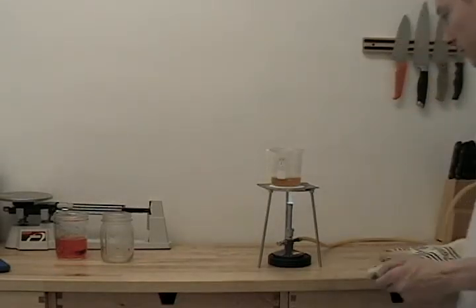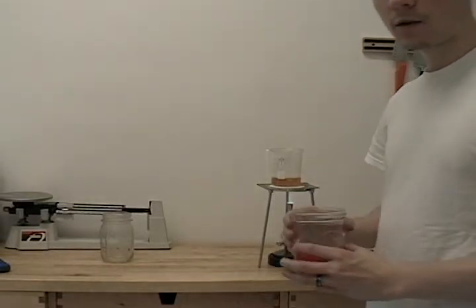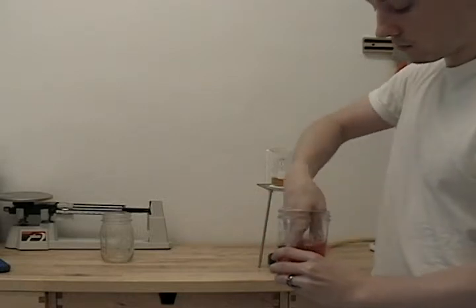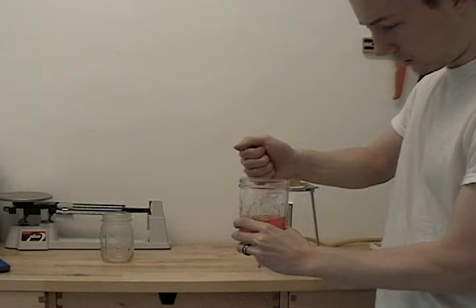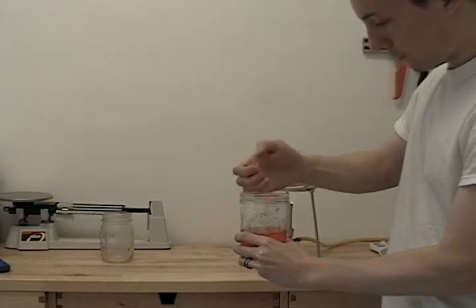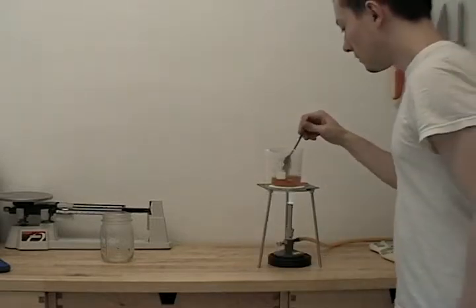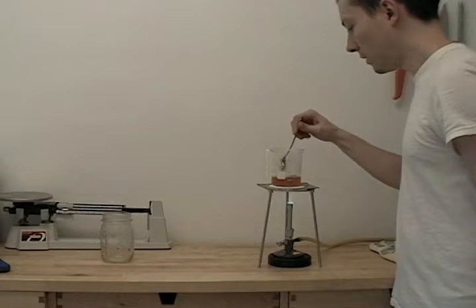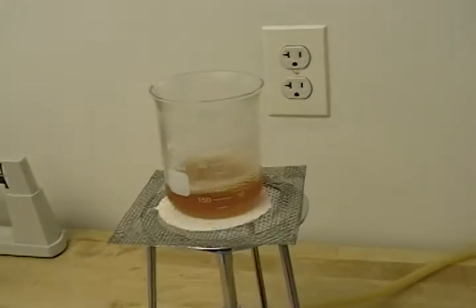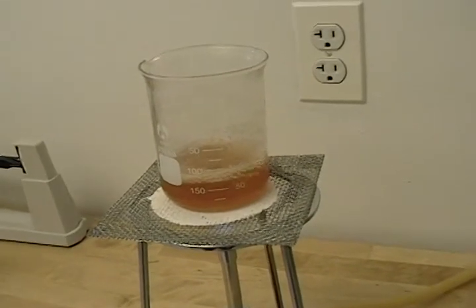At this point our agar has been soaking long enough, so we'll grab it, squeeze it to strain out all the excess liquid, and dump it in. Now we'll just let this come back to a boil so the agar can dissolve and we'll be ready to sterilize this and our plates. The agar has dissolved and we are ready for the next phase, which is sterilization.